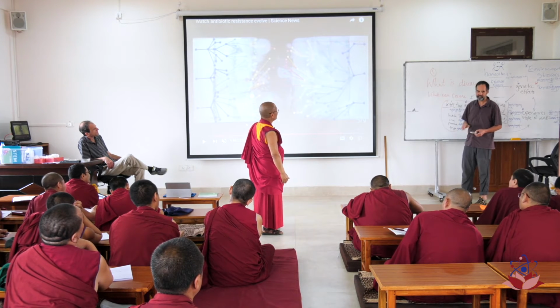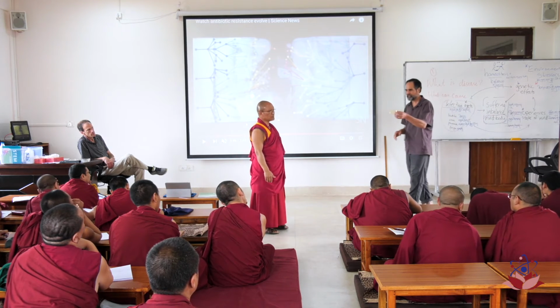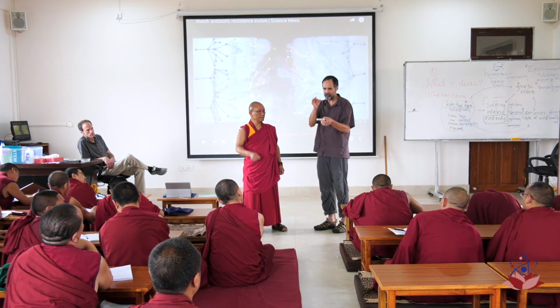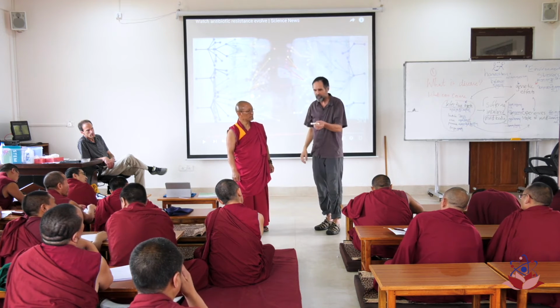Yeah, okay. So we'll talk about that tomorrow. Okay, now when you looked at this plate, right, what did you see? What was the natural history of this plate? Now remember, it started with a single clone here, single clone there, single clone here. Now this plate looks different.